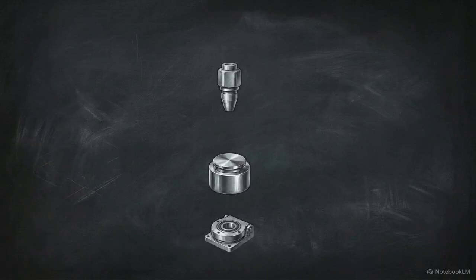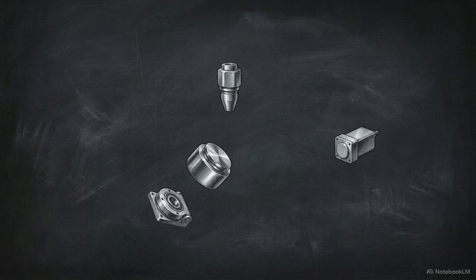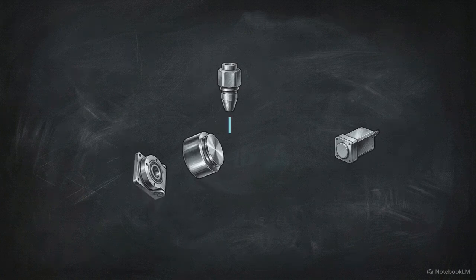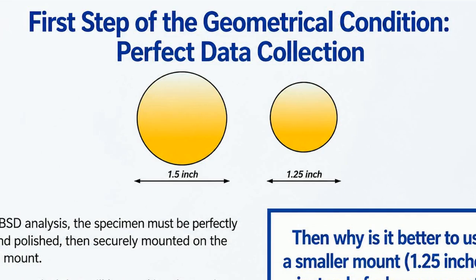But because the macroscopic electron column is fixed vertically, adding a lateral detector introduces a severe geometric conflict at the mesoscopic scale. To direct a sufficient yield of backscattered electrons toward the EBSD detector, the sample stage must be tilted to roughly 70 degrees relative to the incident beam. Tilting a solid metallic stage to 70 degrees inside a confined vacuum chamber drastically reduces the available spatial clearance between the hardware components. This geometric constraint highlights a common novice error.